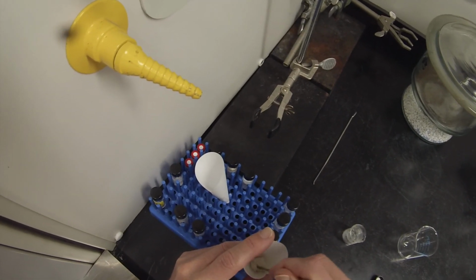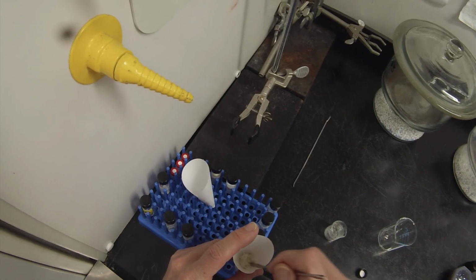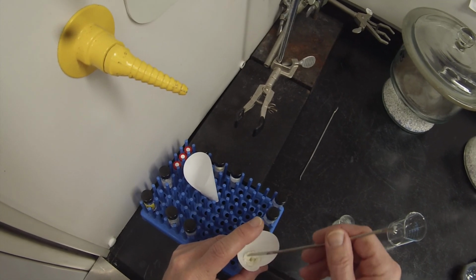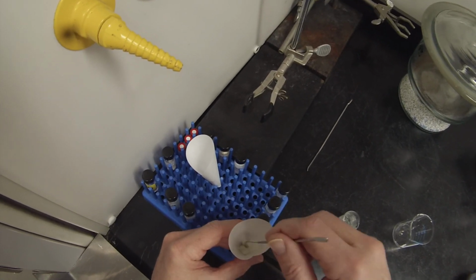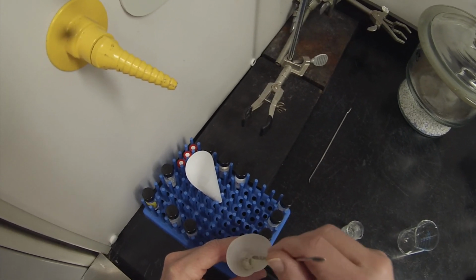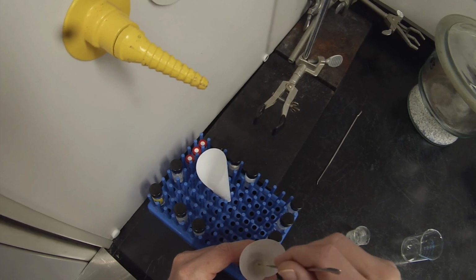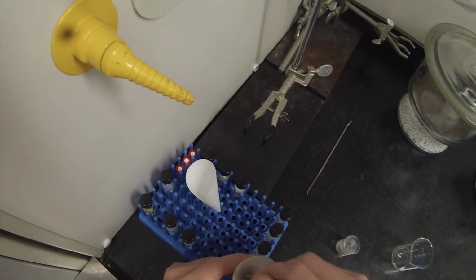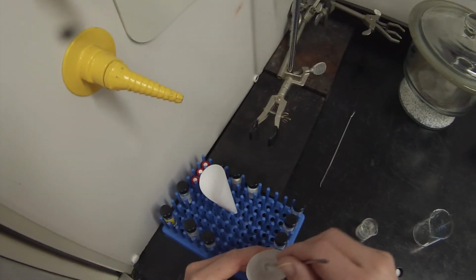I'm just going to try to push it through. And then we'll lose a little bit because it's static. And you can see it's trying to stick to the spatula. Not going to worry about a little loss though, because we have way more than we actually need for the analysis. And we've already done some GC mass spec analysis. So you want to get an IR, proton, carbon NMR, and melting point for the rest of the characterization.